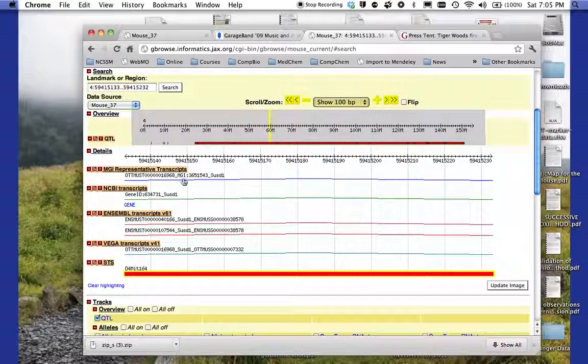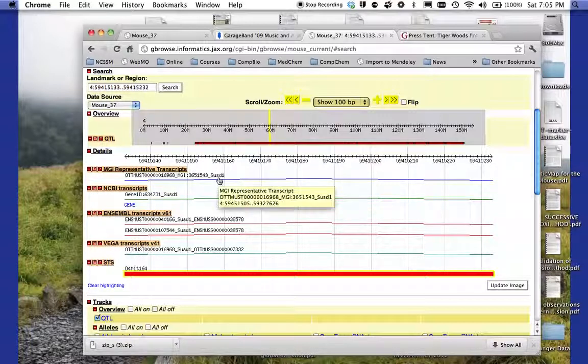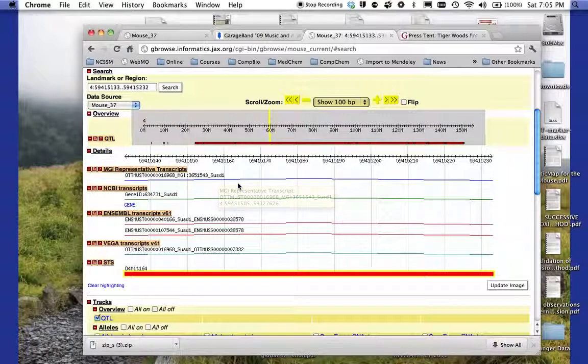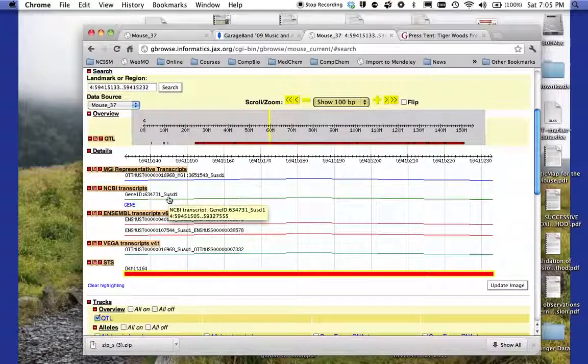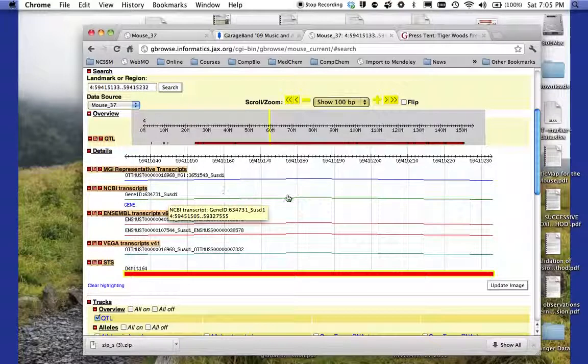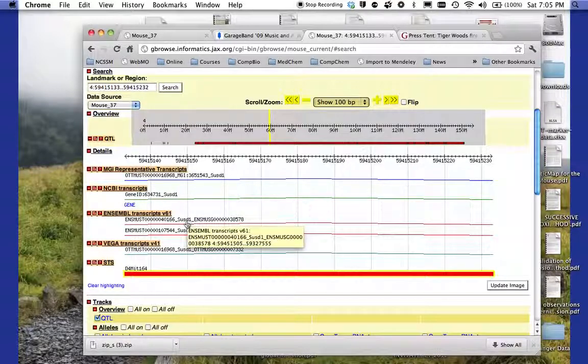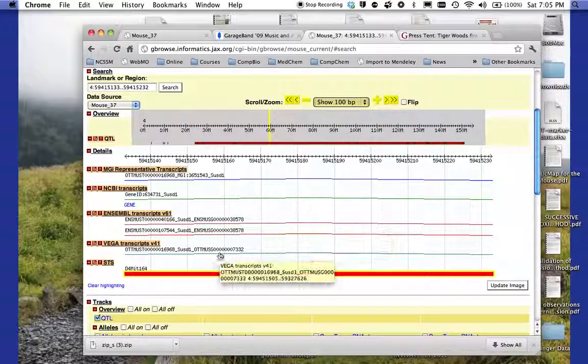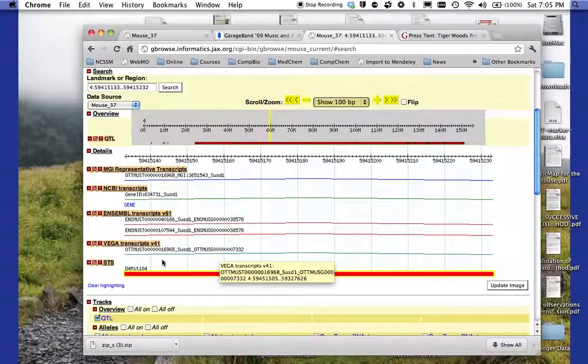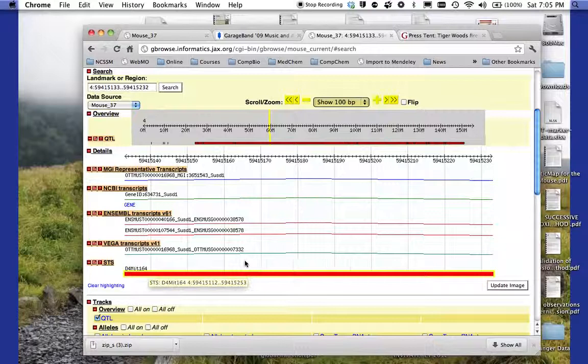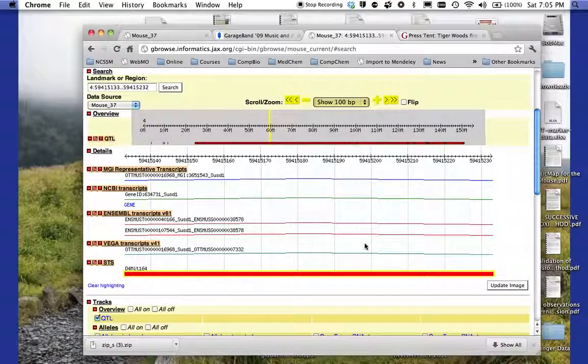Coming down here, I can see some different transcripts. So I see there's a transcript there called SUSD1. And NCBI shows that I have one there as well. Ensemble shows that I have the same gene going on down, so on and so forth.